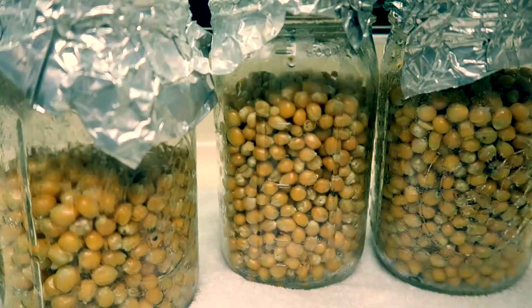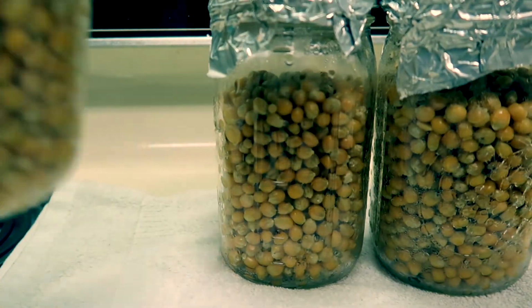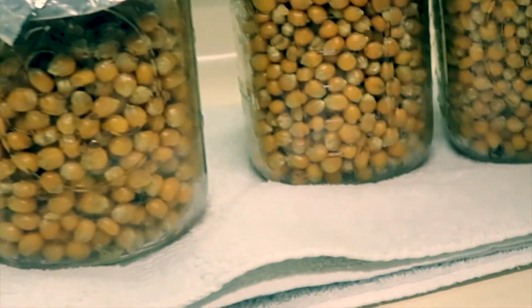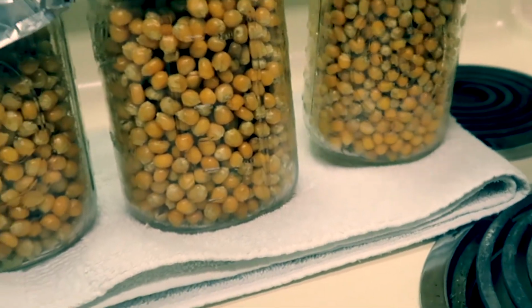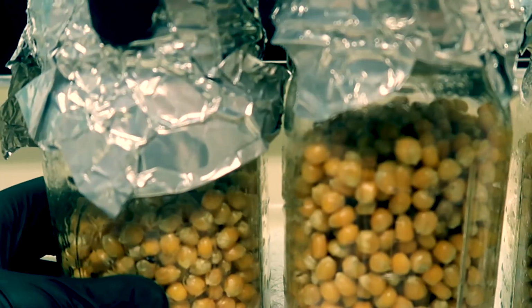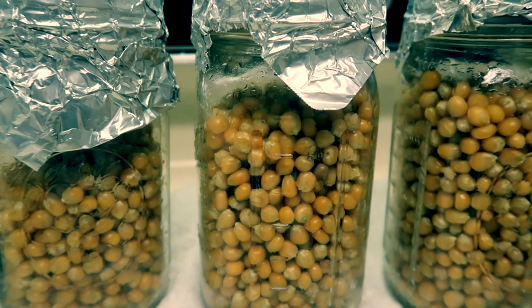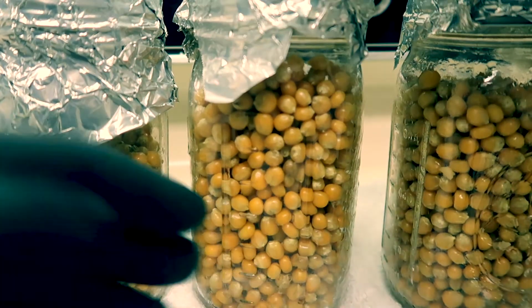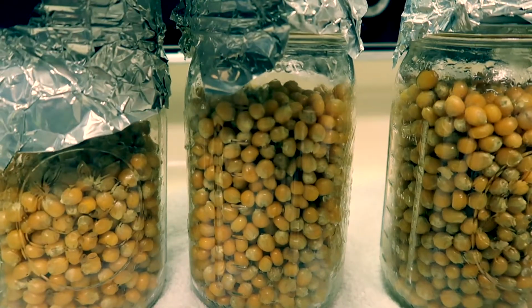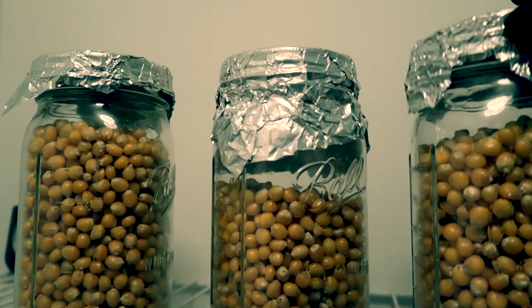So after we pressure cook or we steam sterilize just like this, all we do is shake the grain jars up to help redistribute some of that moisture, and over time the grains will reabsorb that moisture. Now that they've been shaken up, we can go ahead and loosen the lid just a little bit, to help dissipate some of the moisture. My personal preference is to just let them sit a little longer to help some of that moisture get reabsorbed by the grains, as well as to just kind of evaporate through our little unmodified lids here. I let these sit for about a day with the lids loose and the dust covers on them.